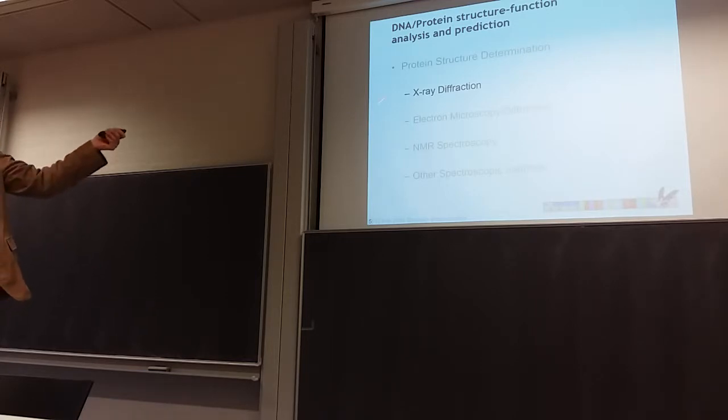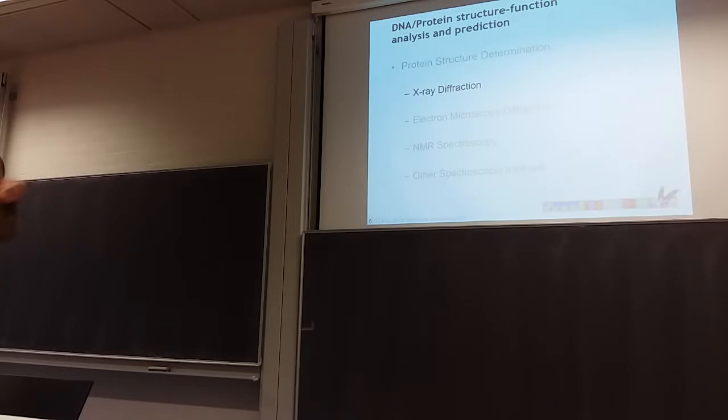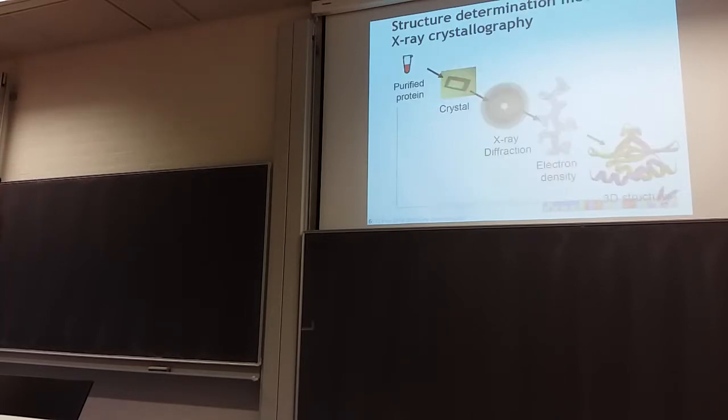Most of the structures that we have nowadays, by far, I think it must be something like 85%, if not higher, the structures in the PDB, they come from X-ray diffraction. Okay, so that's why we start there.